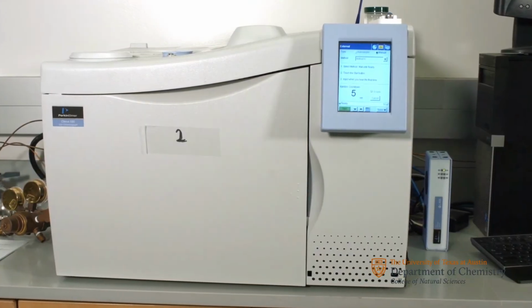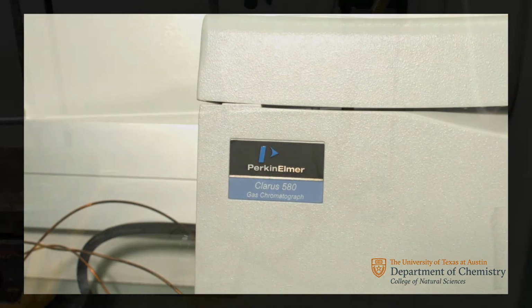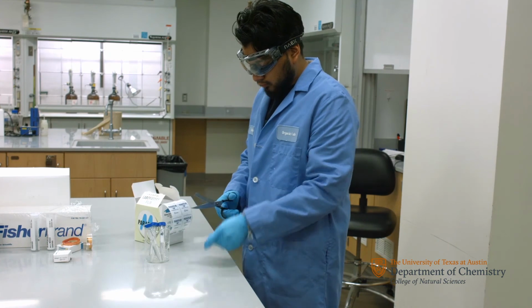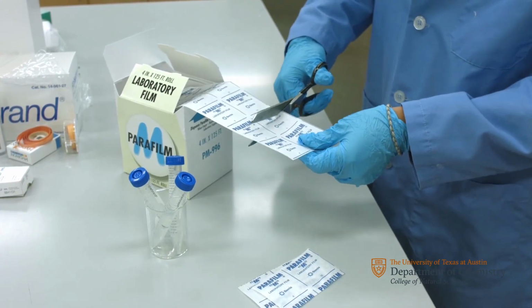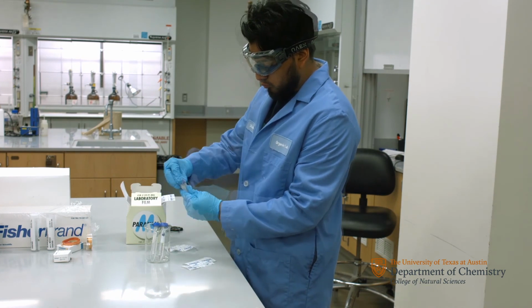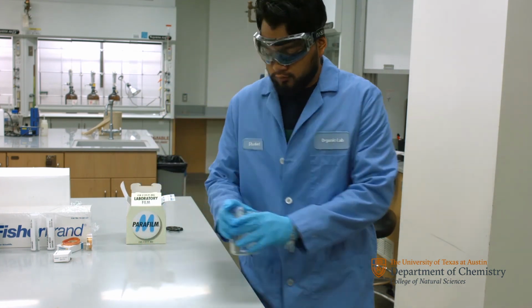If you have time, shoot your fractions A, B, and C on the GC or gas chromatograph. For more detail, refer to the gas chromatography video. Whether you have the time or not, save your 3 fractions properly by placing parafilm around the top of each centrifuge tube as shown here. First, cut 3 strips. Wrap each tube's cap with the parafilm so that it is sealed. Place the 3 tubes in a beaker and store them in your locker for future use.